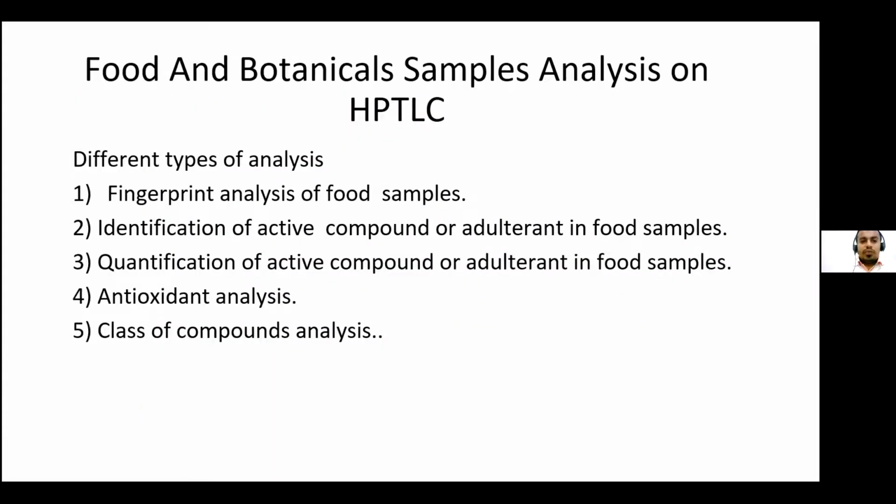So food and botanical sample analysis on HPTLC. So various type of analysis can be performed by using HPTLC for foods. First is the fingerprint analysis for food. Next is the identification, quantification, antioxidant, and class of compound analysis.